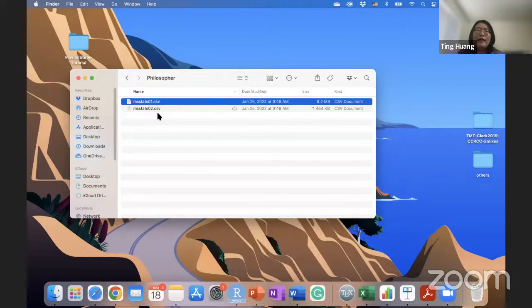So that's why we collaborate with the tool developers. We asked if it is possible to output the format required by MSstats or MSstatsTMT, so the user doesn't need to do any manipulation of the data. They can directly use the output from the tool and run MSstats and MSstatsTMT. So that's what happened here with FragPipe.